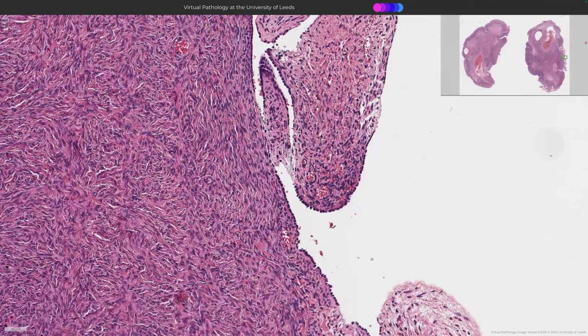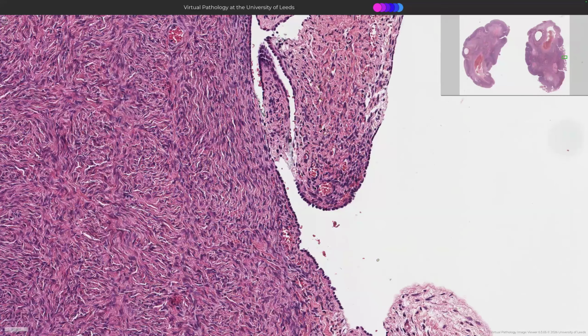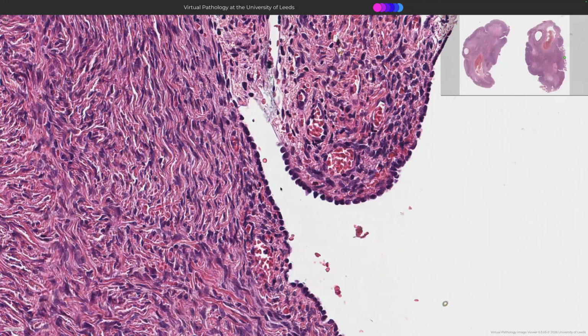Oh, Adam, germinal epithelium. Would you like to unmute and tell me, is this something I don't know? I think it's just a term I read. It's the same thing as mesothelium, just when it covers the ovary. It's called the germinal epithelium. Very good. All right. Notice the little peg shaped cells, and they're all kind of separate to each other. This is very typical of mesothelial cells, and it's one way that you can tell them from epithelial cells, which aren't quite so hobnail-like normally.